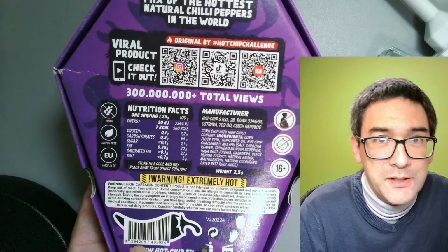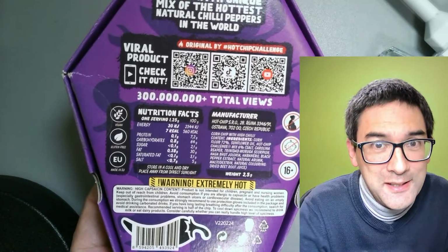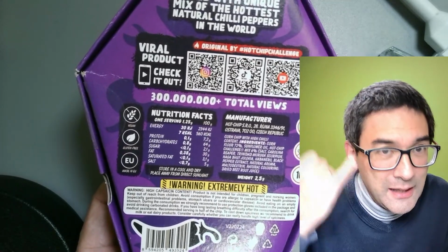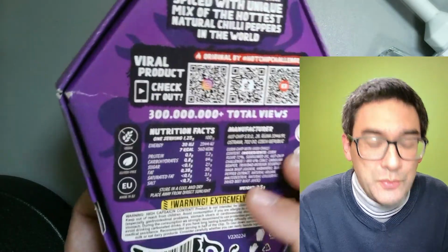And so this is actually one of the reasons why I'm also not wearing my contact lenses now, but glasses, because in case some of the powder goes into my eyes, it's easier to get it out again if I'm wearing glasses. I do not want to get it beneath my contact lenses. Okay, so that's also another reason here.